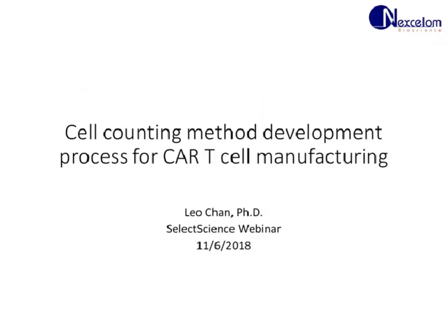Hi, everyone. My name is Leo Chan from Nexcelom Bioscience, and thank you for coming to the Select Science webinar series with the title Cell Counting Methods Development Process for CAR T-cell manufacturing. Today I would like to go through how to develop cell counting methods and what the pitfalls are of different cell counting methods that are currently being used for CAR T-cell manufacturing. I hope by the end of the webinar, you will understand the importance of cell counting in this type of field, development and manufacturing.